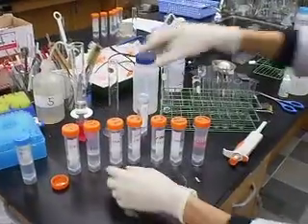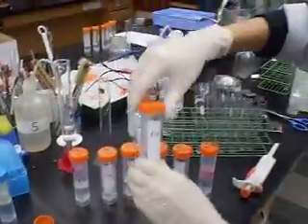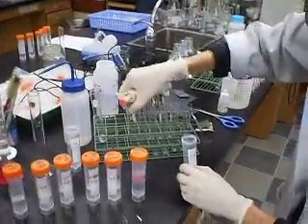We're going to transfer the HCl now — 0.5M hydrochloric acid. We're going to transfer 5ml into each test tube.